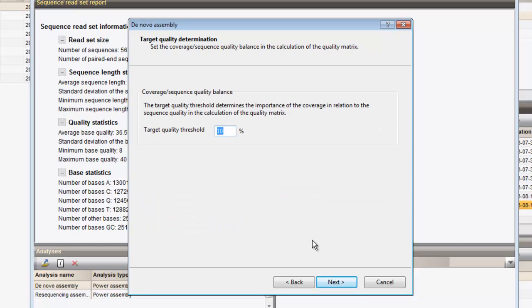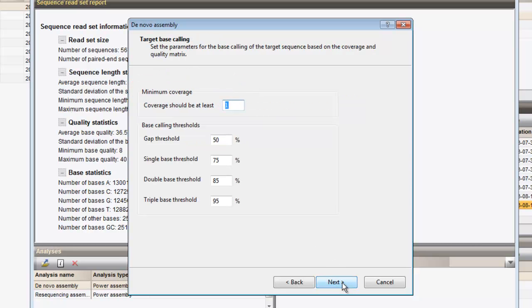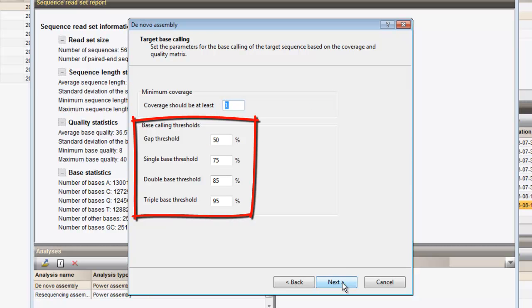Once the mapping is created, the bases of the target sequence will be called. The next pages contain the sequence quality settings and the base calling parameters.